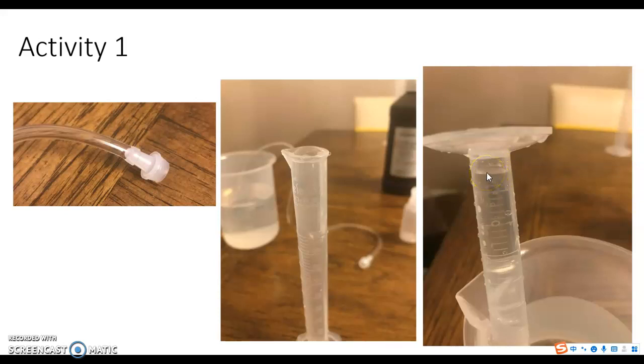It's kind of hard to read the readings when it's upside down, and also it's kind of tilted because of the tubing at the bottom. But try your best to get the best estimation. Once the reaction starts, you will see bubbles coming in and the water level decrease. Let's say it decreased to this marking and stops.